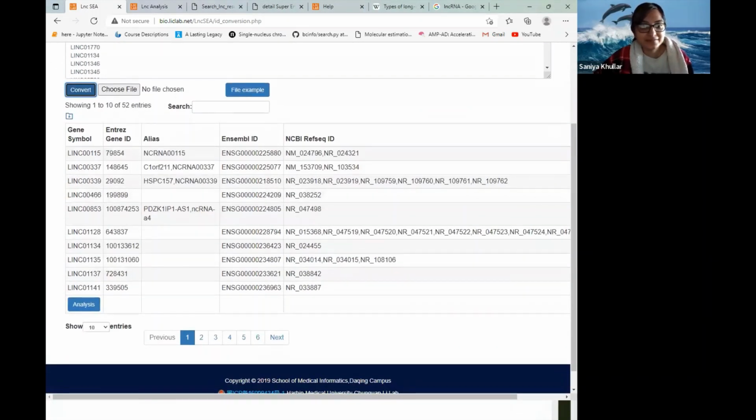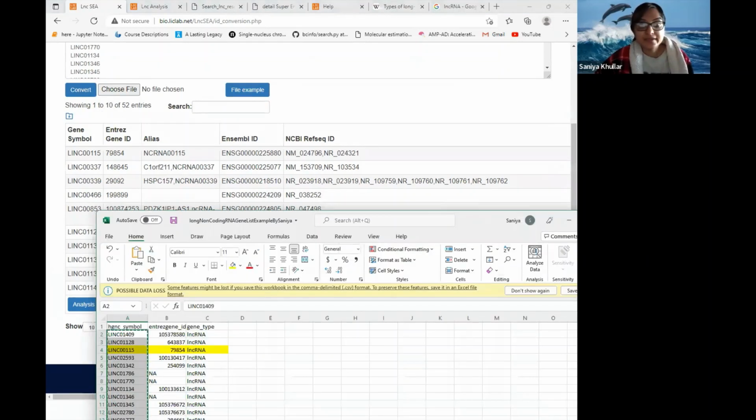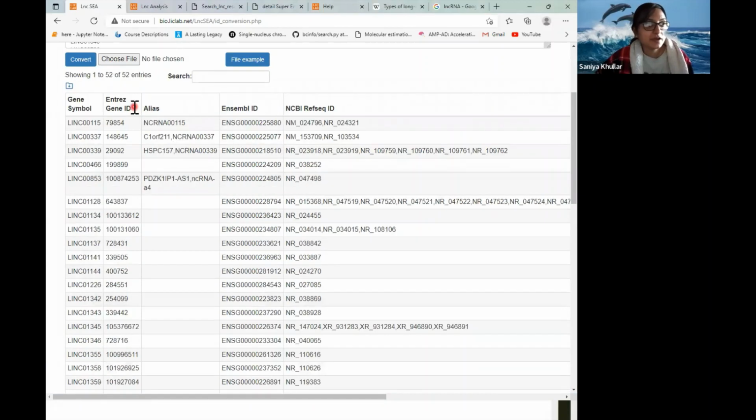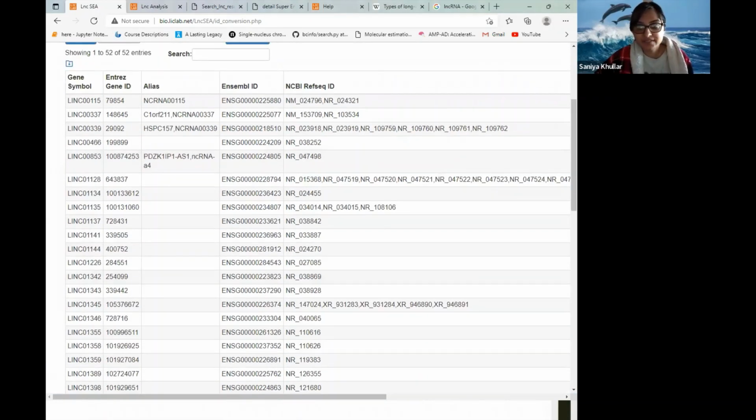One of the things we're going to see that I was trying to highlight is that I think it didn't quite find all of the 74, but it did find 52 out of the 74, which is kind of good. So it's still giving us some information on those.